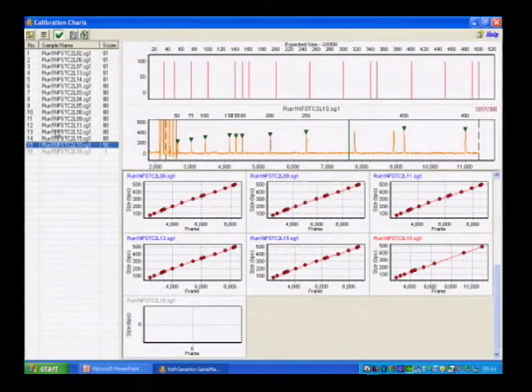And you'll see that the software somehow did not pick up enough of the peaks. These two peaks, I think, are clear enough to identify as sizing peaks, but it didn't pick it up. So what I'm going to do for this specific lane is, we can either add the peaks or just not analyze it and consider it a failed lane.